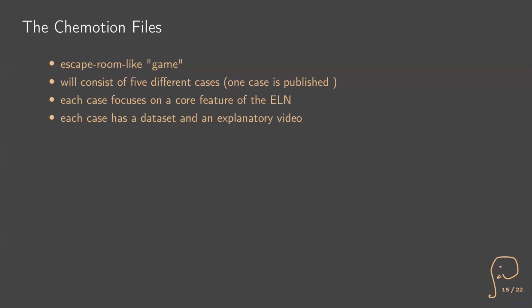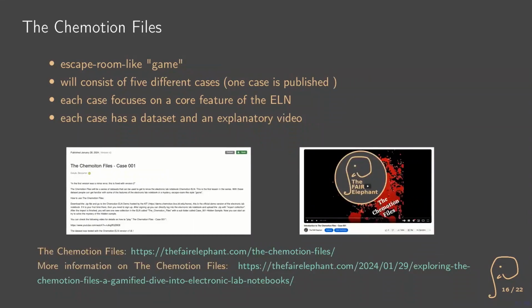And each case will focus on one core functionality of the ELN. You will see this because I will show you an example with the first case in a minute. Each case also consists of one data set and one video where it's explained a little bit more what you're supposed to do with the data set and how to set up the Chemotion files. So you can see this here.